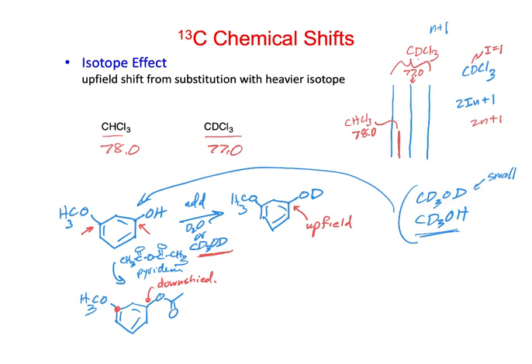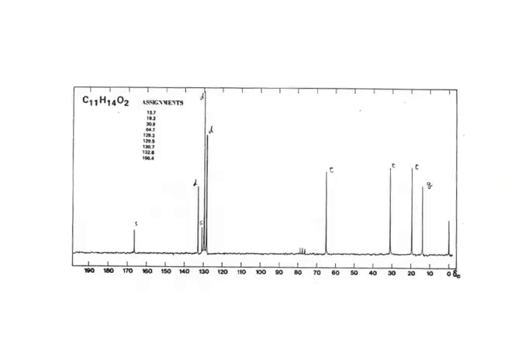I had another nice experiment on a molecule that we did, but I can't really draw it now, where it was kind of surprising that we ended up having some deuterium exchange into our molecule. We were able to confirm it by changes in, for one, a proton signal would disappear, but then we could look at some chemical shift differences in the C13 as well. All right, so let's look at a couple of problems here.